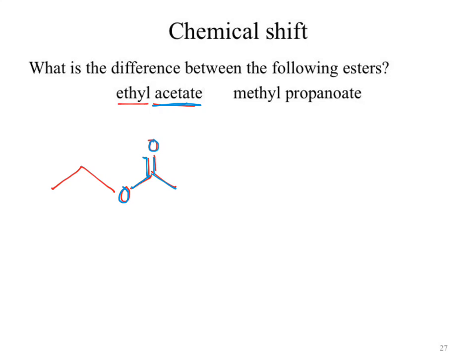Based on that information, what can we do with the next one? We have methyl and we have propanoate. Why is that propanoate? How many carbons? 3. There's our prop. There's our methyl. Formula for both of these is what? Assuming I did this right. Exact same chemical formula.